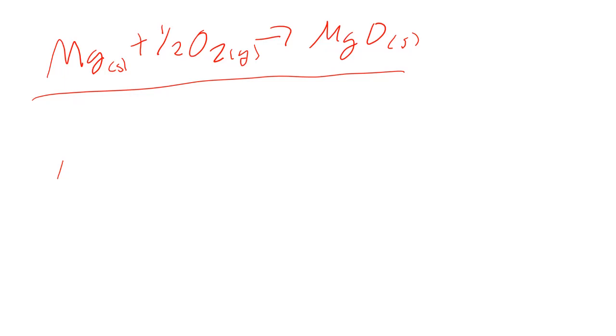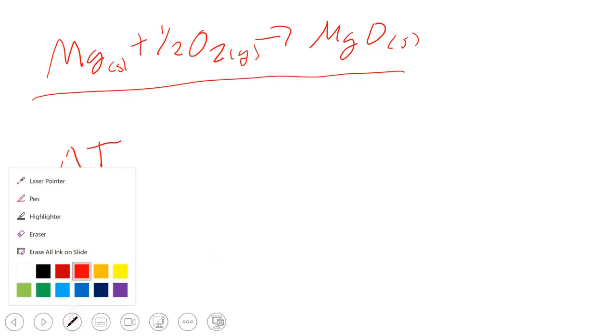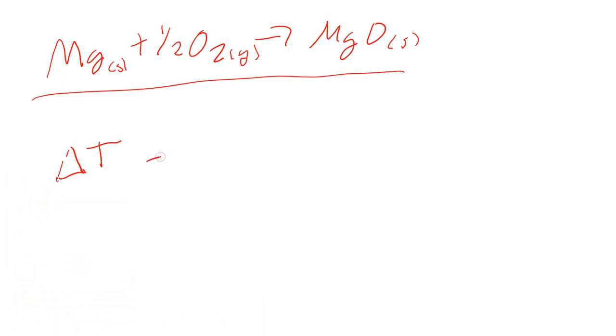So you're going to calculate the change in temperature for each one of these reactions. And remember, delta T equals the final temperature minus the initial temperature. So you're going to record your final temperature, which will be your highest temperature probably, or possibly your lowest temperature, and your initial temperature, and calculate delta T. So that's step 1 of processing the data.